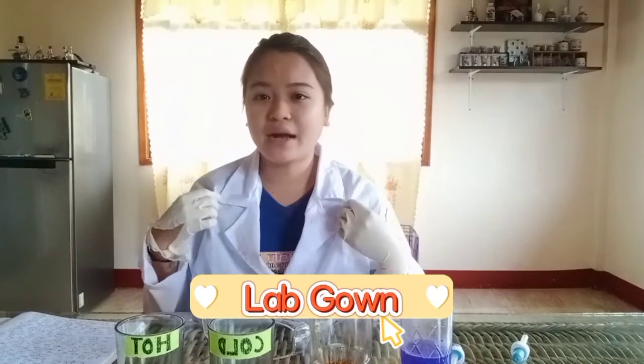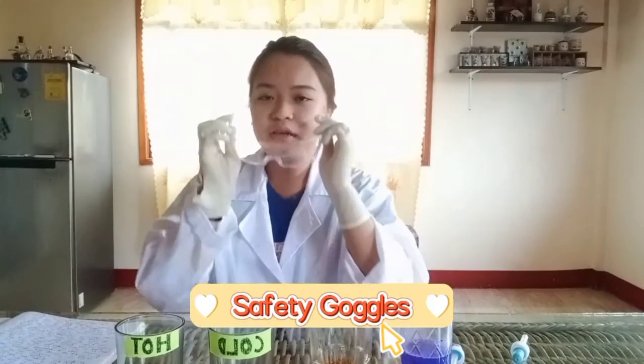But before anything else, please note that in conducting any kind of experiment, we should always wear our lab gowns, our laboratory gloves, and our safety goggles to protect ourselves from different chemicals inside the laboratory. And for girls, we should always tie our hair to avoid distractions.